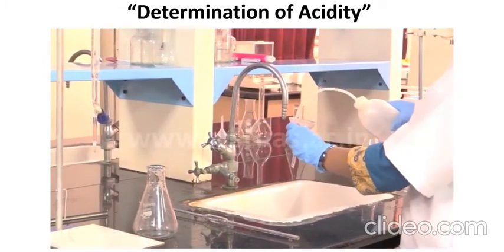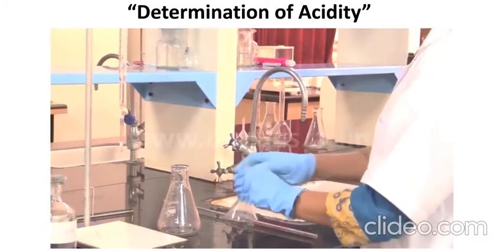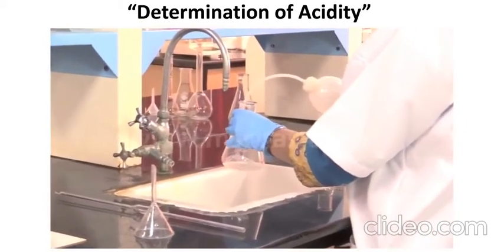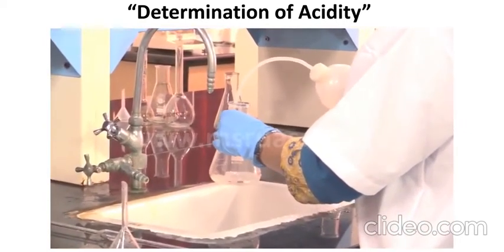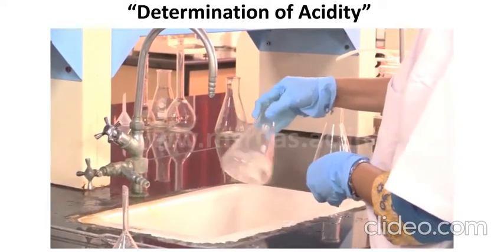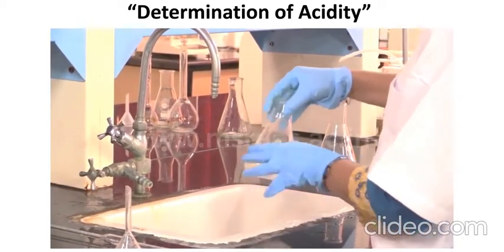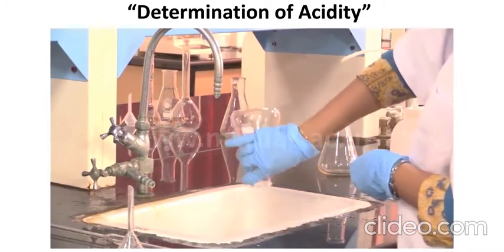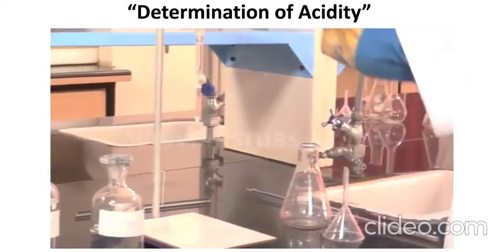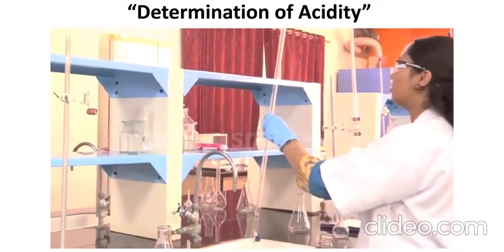Rinse the funnel with the distilled water. Also rinse the conical flask with the distilled water. Next we need to rinse the buret with the distilled water.